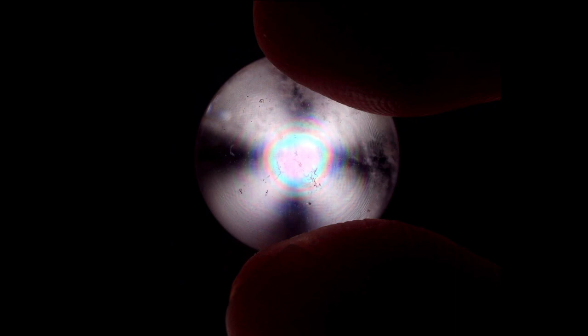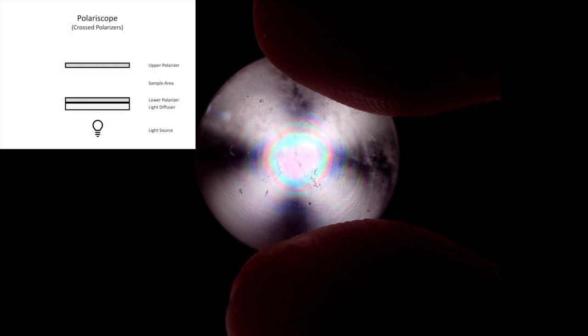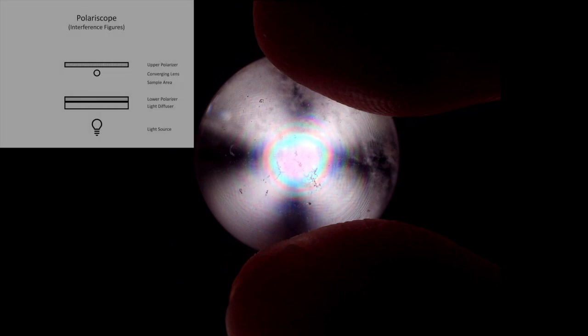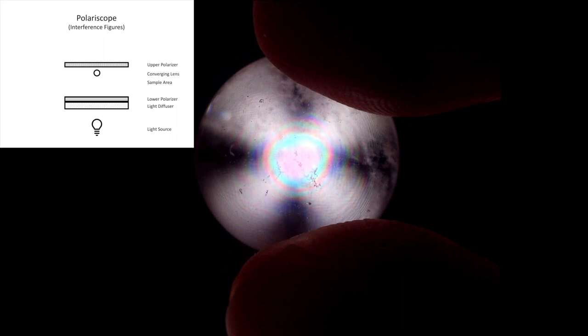We should point out that it's a little strange that we're viewing a uniaxial optic axis interference figure in this moment, because we haven't set up our polariscope to generate one. Right now we're at crossed polarizers and we haven't brought in a converging lens, which is usually necessary to generate the optic axis interference figure. The reason why is because the quartz sphere itself is acting as a converging lens — no need to bring an additional lens in.